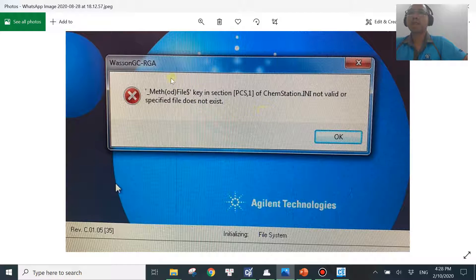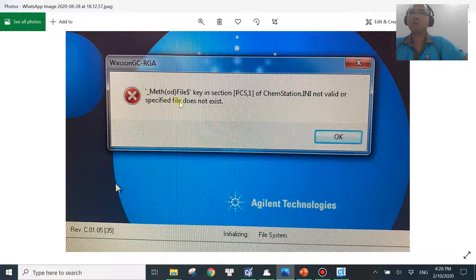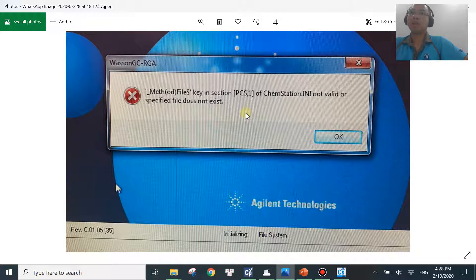The same meaning applies — the method is missing — but the older version doesn't say which method, which is one reason the new version is a bit better. It's saying the method referenced in this file section is missing. The issue is that most of the time you don't know which method it's looking for, because in a lab with multiple users or after an IT department backup, some methods may disappear without you knowing.